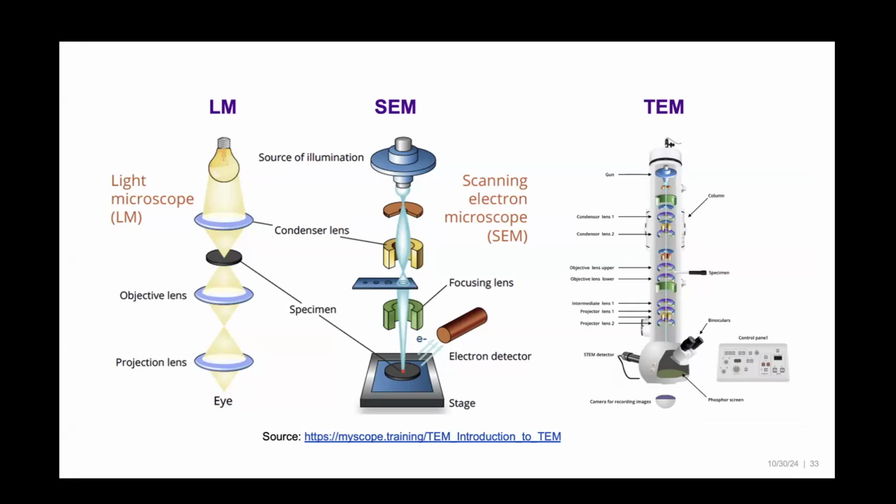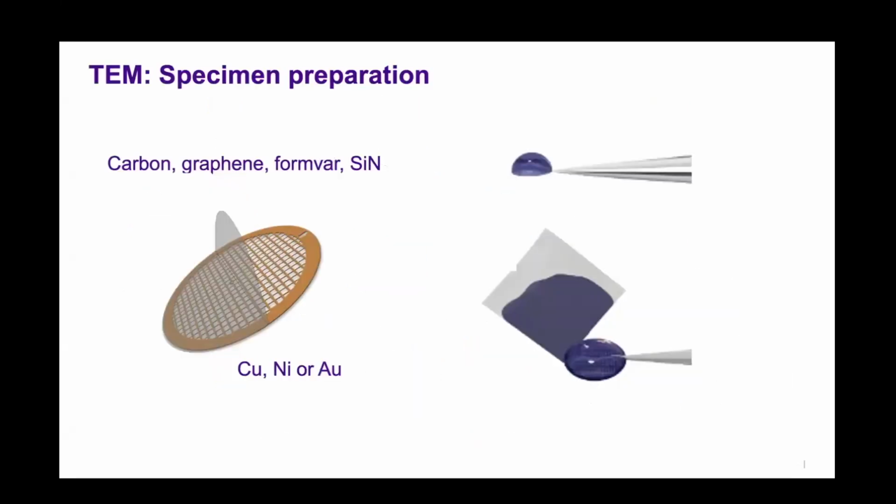So here is a light microscope. Here is a scanning electron microscope and then a transmission electron microscope. We see the complexity in the anatomy of the microscopes increasing. At the same time, we also see the resolution is increasing. From nanometers, we are looking at atoms or even at the picometer level these days, with very expensive instruments. This high-end microscope can cost from 2 million to 10 million euros. They are so big, they cover an entire building, and are highly sophisticated.